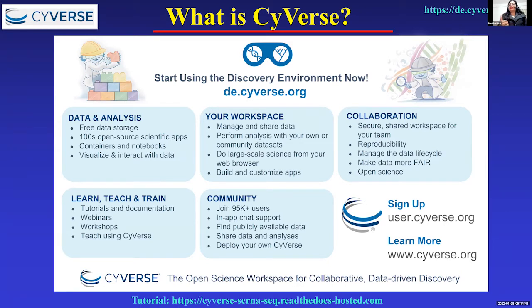So it is impossible for us to do such huge uploads and downloads, and then use so much RAM on our normal systems, unless we are working on high performance computers. It becomes very tedious to download with some speed and do all the computational analysis on our system. So CyVerse becomes very handy in multiple ways.